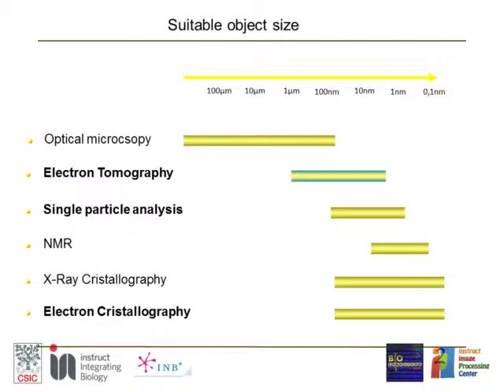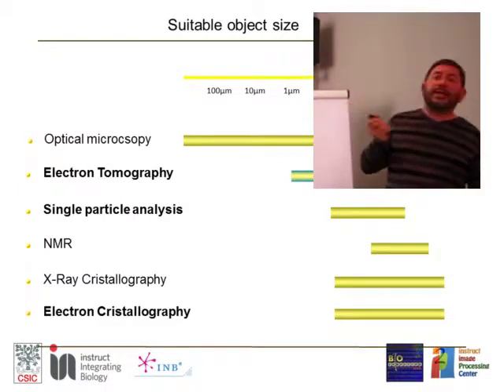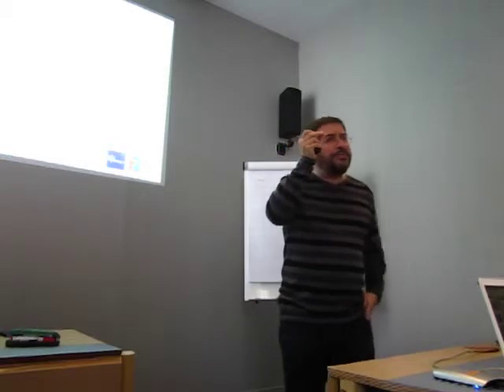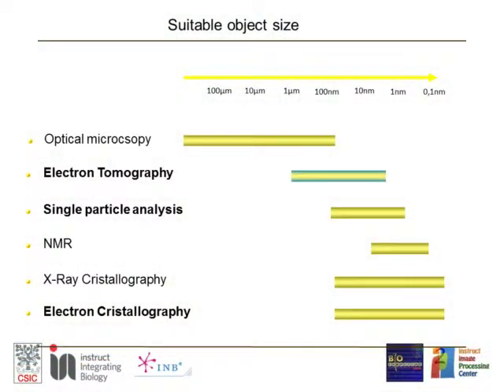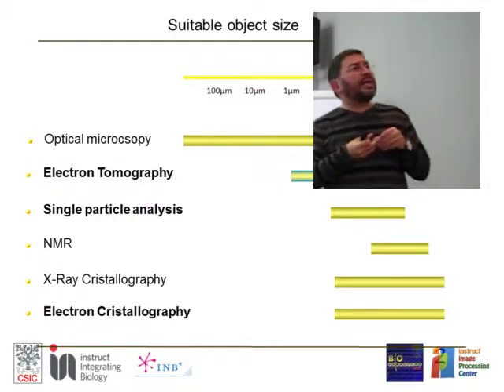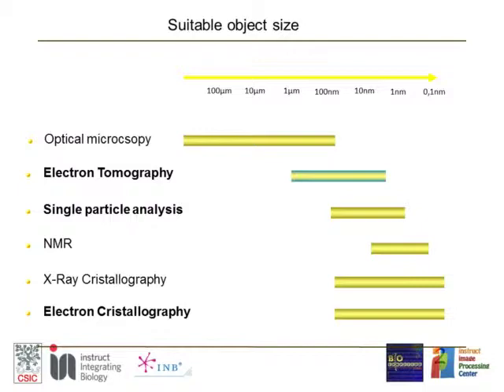In electron tomography, we are going to see small cells or whole organelles of the cell, normally at a resolution about one order of magnitude worse than for single particle analysis. So electron tomography is the way to get the cellular context, for thin cells. If you have a macromolecule and you are asking whether the macromolecule in the tube resembles the macromolecule as it is in the cell, then electron tomography, by giving you access to at least sections of cells, gives you the capability to see the 3D structure in the context of the cell. This is for small cells, up to, say, half a micron, something like that.